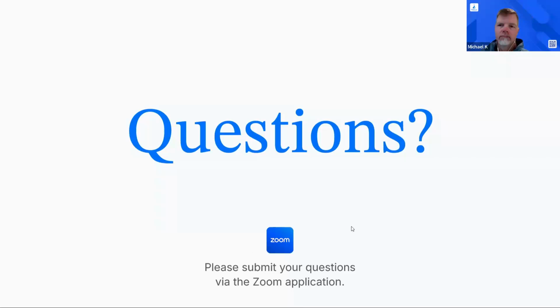Okay. I have a question or two for the group here. I think it was mentioned right at the end by Allison, the portal situation with this platform and how that relates to lab outreach. Allison, can you tell us just a little bit about what we offer and how it works? Yeah, with the LIS, we have a client and physician web-based portal, which the primary features are ordering, so they can enter their order. Your clients can enter their orders from that web portal.